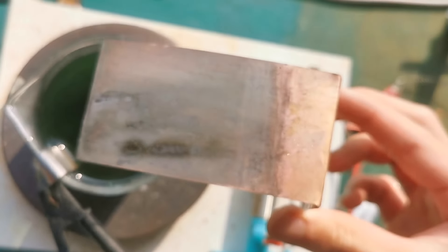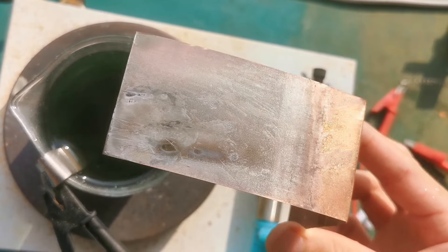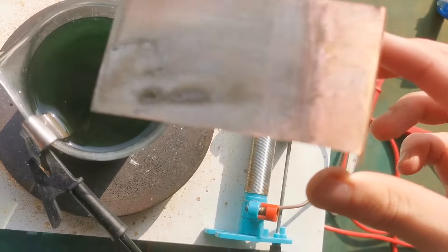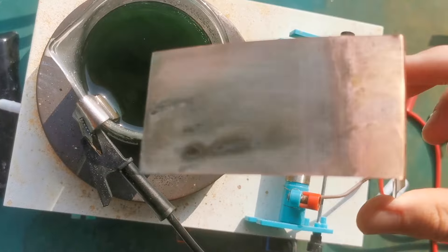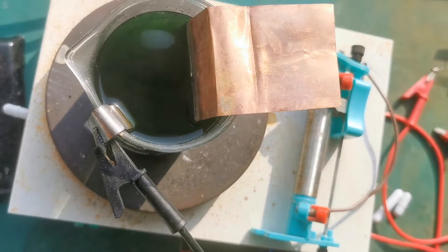It was quite thin, but still showed a significant silver-black color. Note that the surface of the copper that didn't face the lead anode is not nickel plated, which means that we need to switch the sides occasionally to ensure even plating.